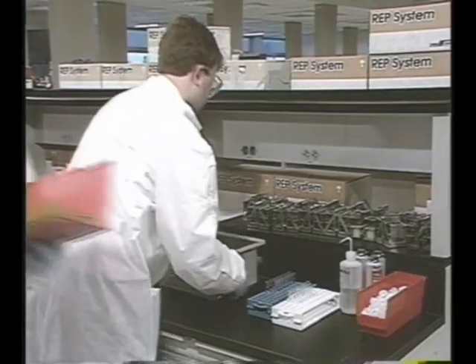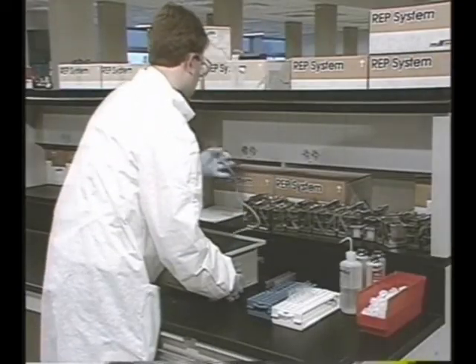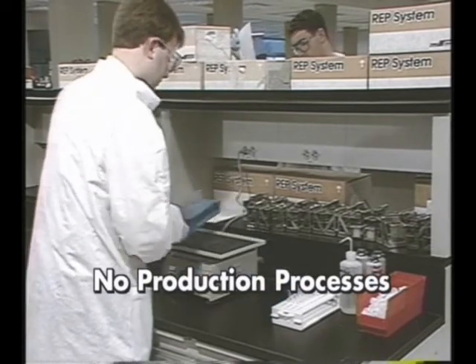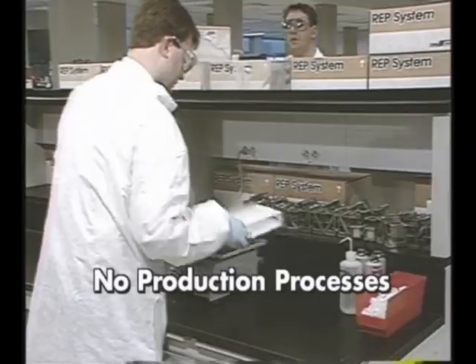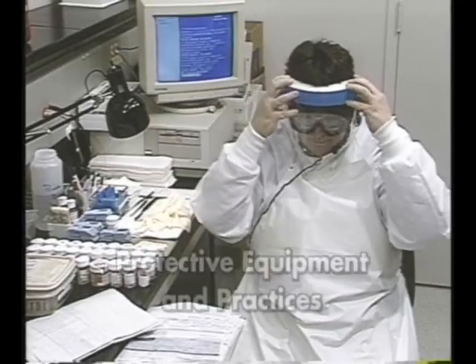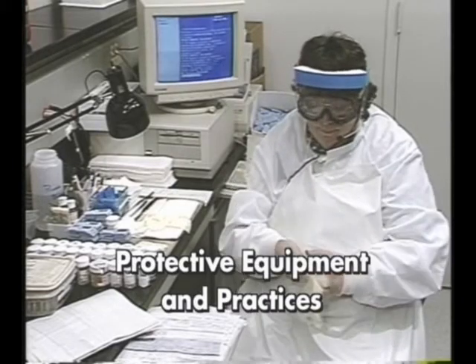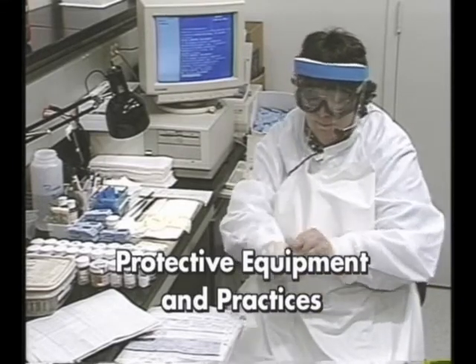However, none of the procedures in use can be part of or a simulation of a production process, such as setting up a prototype production line. A laboratory must also have protective equipment and practices available and in use to minimize employees' exposure to hazardous chemicals.